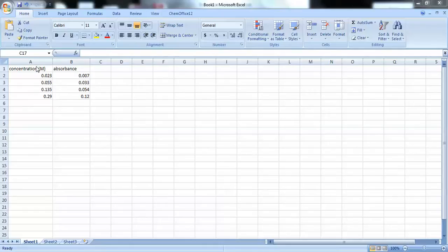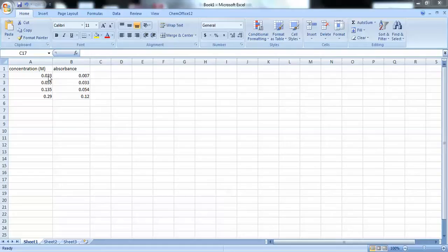So, I've arranged my data into columns. On the left column, I have my concentrations. And you should be able to figure out your concentrations based on the mass that you took for your copper wire.